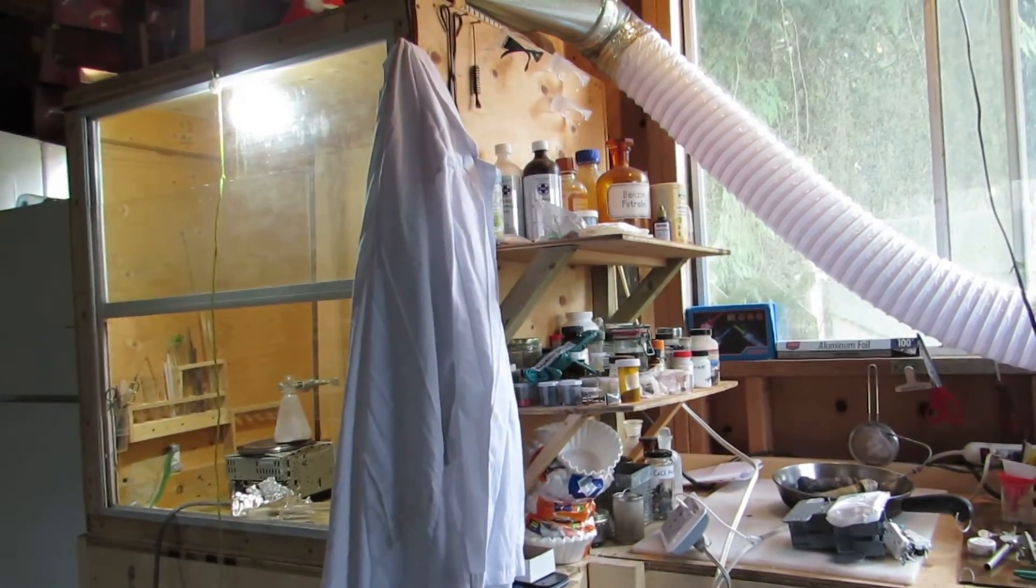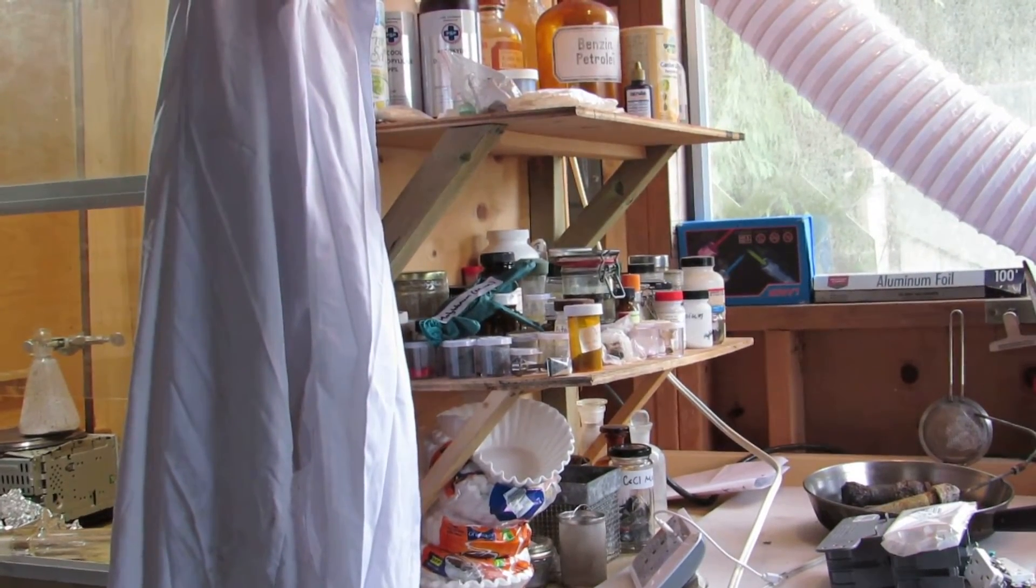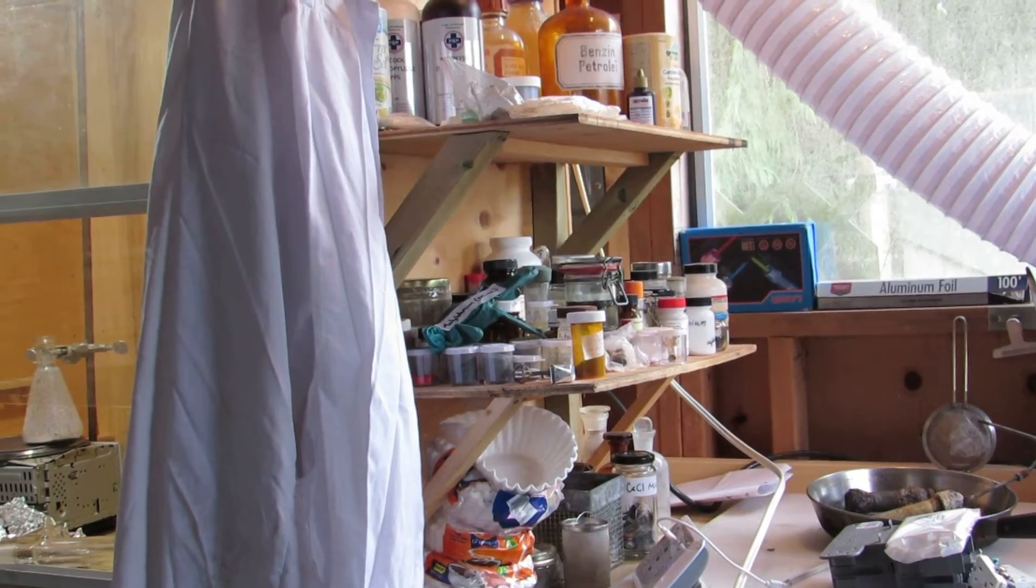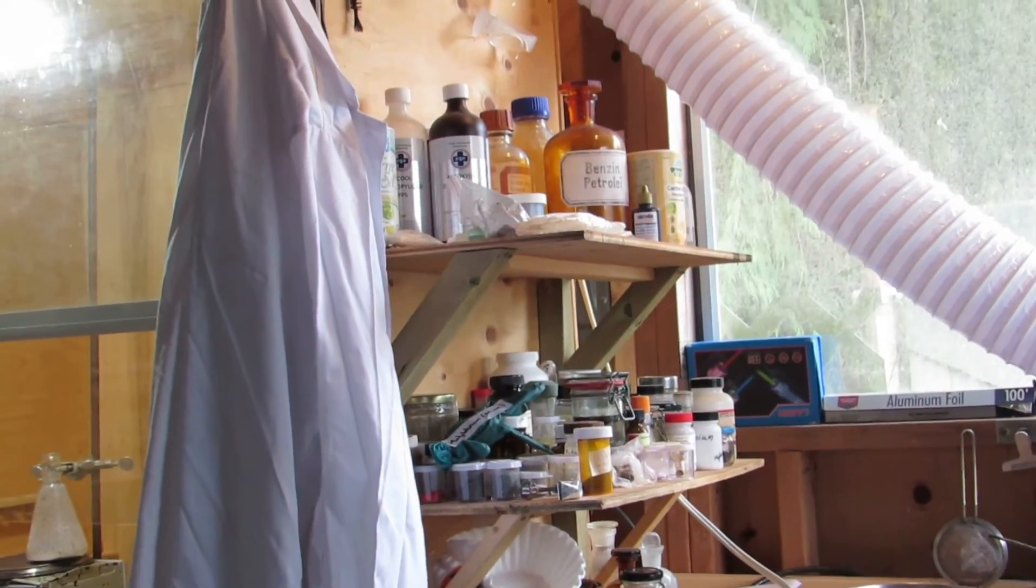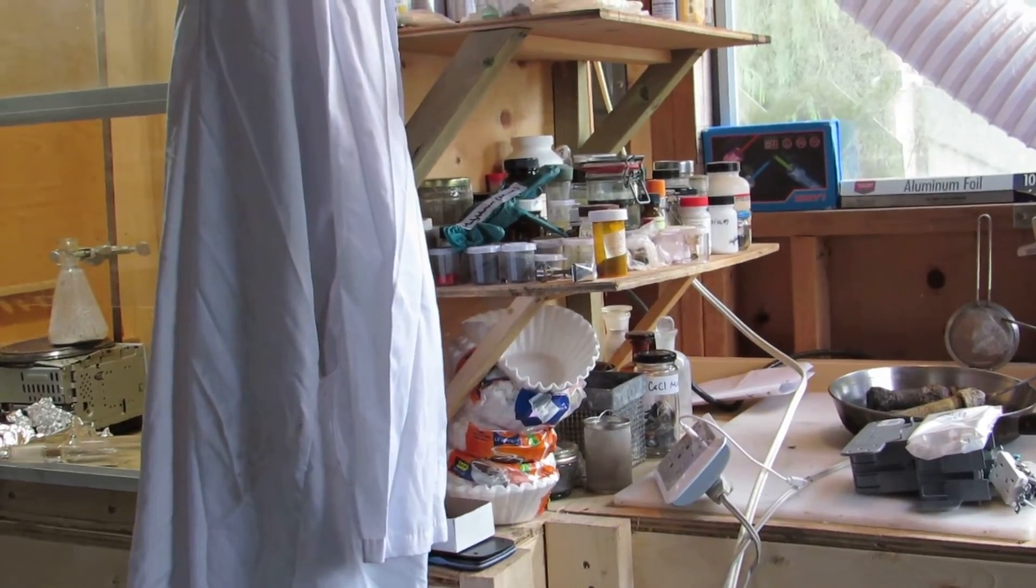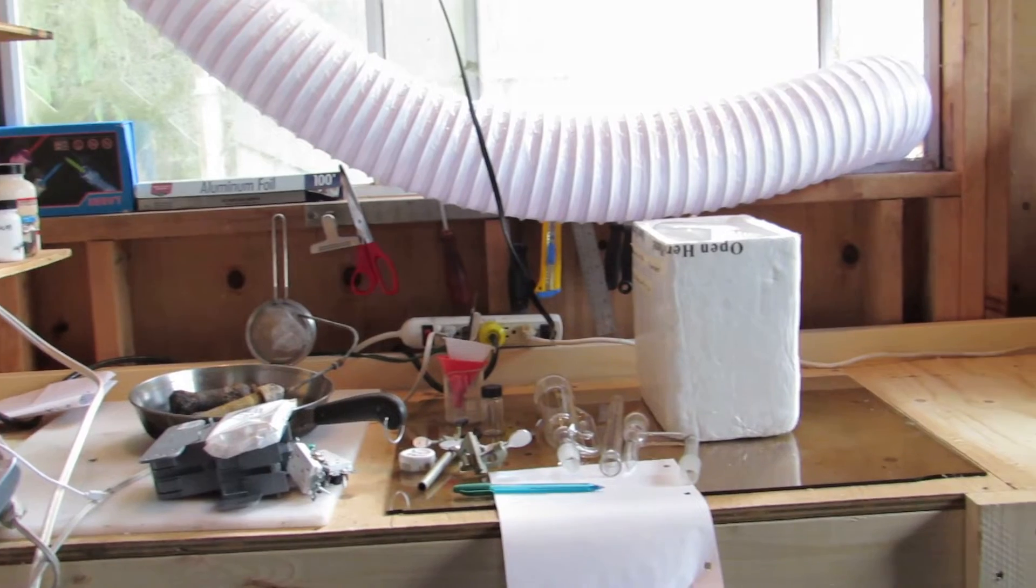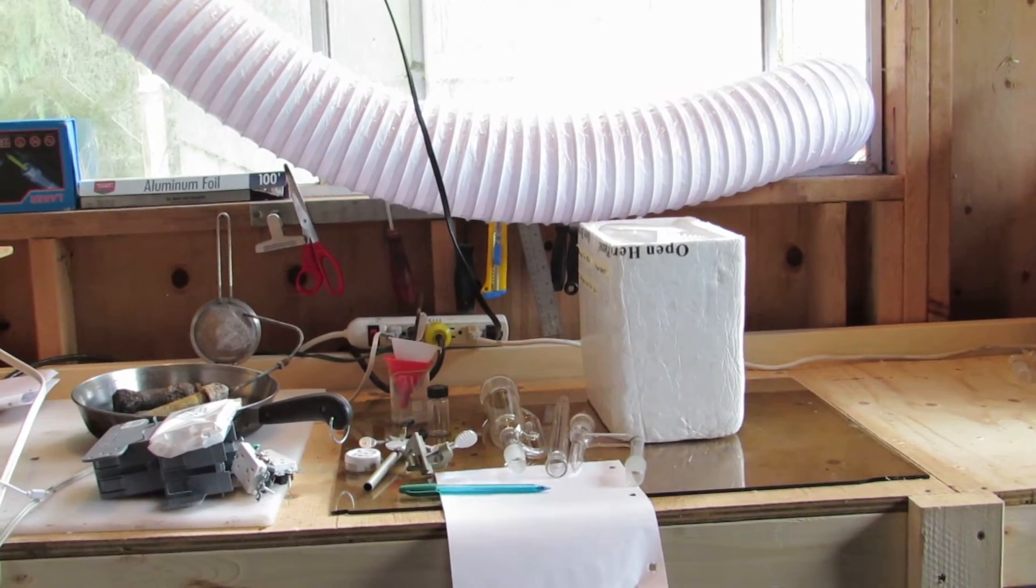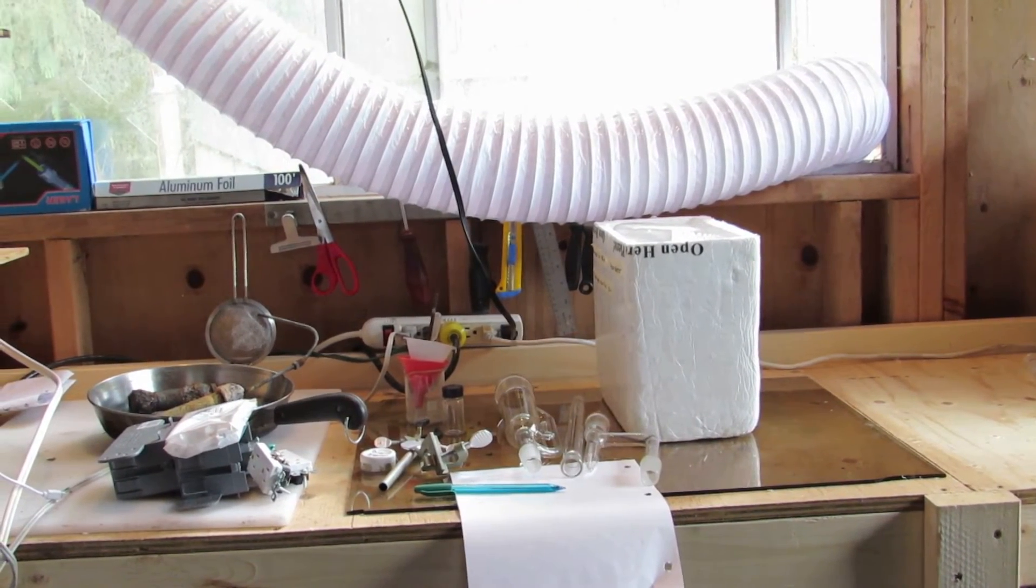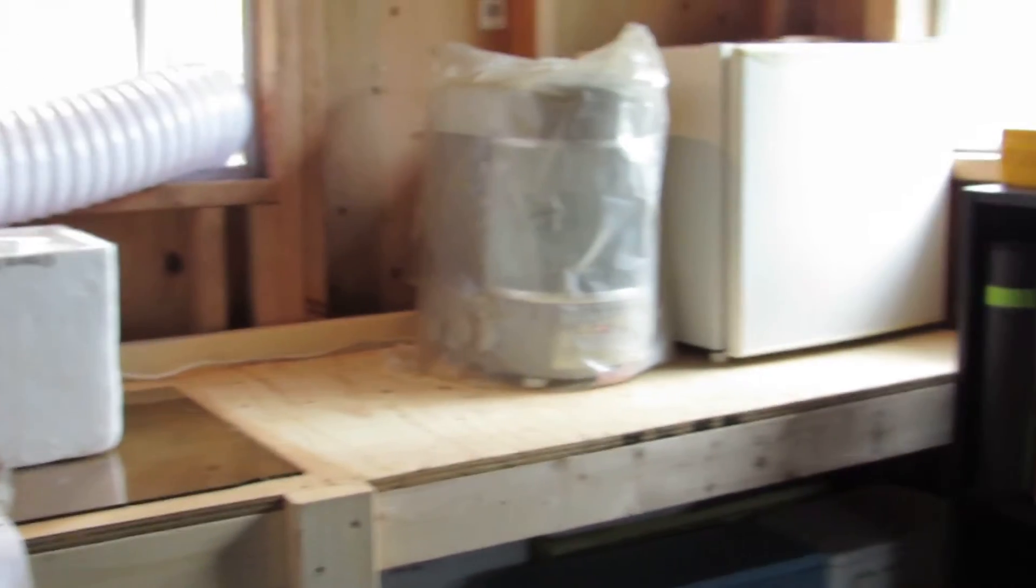Then on the side of my fume hood I have some chemicals here. These are all mostly in small containers and just various chemicals. A lot of my acids are on the top and other chemicals that I use more frequently. And then on the work bench here it's a bit messy. I was just unpacking a bunch of stuff but you can see I have a good amount of space to set up various experiments. And I have this large tube heading out the window from where my fume hood was.